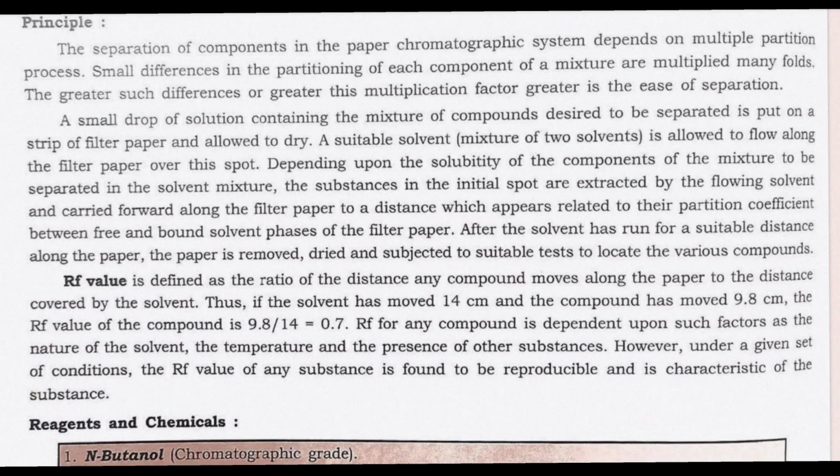A suitable solvent mixture of two solvents is allowed to flow along the filter paper over this spot.